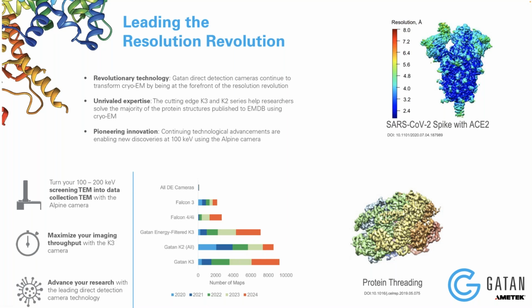So cryo-EM was the launch pad for the K2 and the K3, but I'm more of a materials scientist with a physics background, so I'm interested in what this means, or whether it is applicable for us in the materials science world. And the answer is most definitely yes.